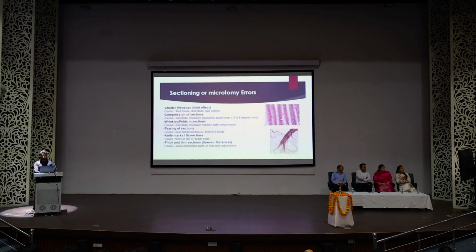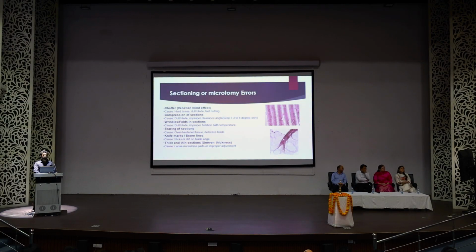You can see here an image. You can see a fold here. This has happened because of low temperature in the tissue flotation bath.